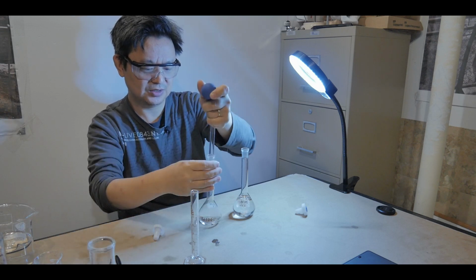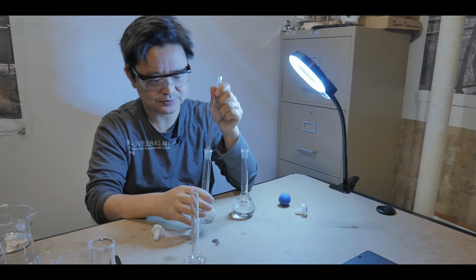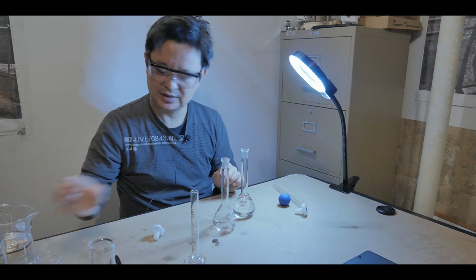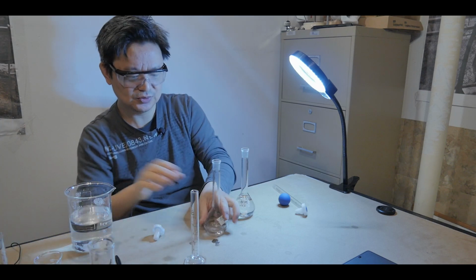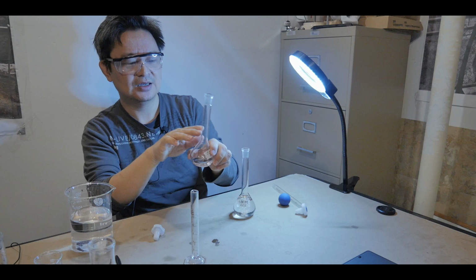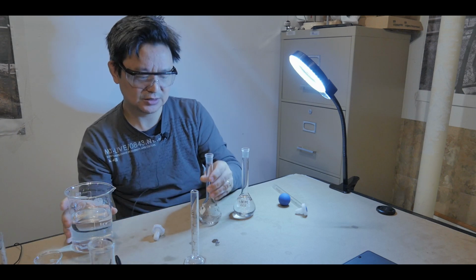Okay, so there's 10 mils of 1 molar solution of hydrochloric acid. You should get everything out as much as you can. Okay, so there's 10 mils in here, and what you want to do next is to add the rest up to the marking here. Then you'll get your rest of your 90. Okay, and then now the solution will be 0.1 molar concentration.